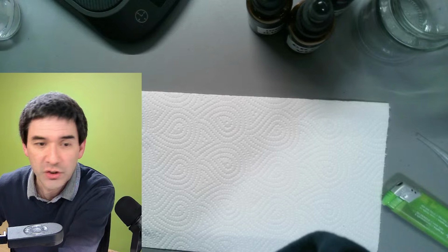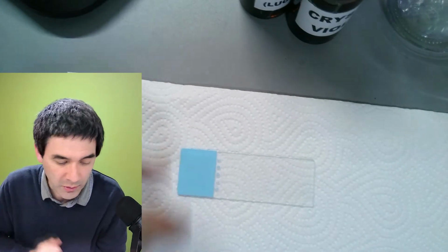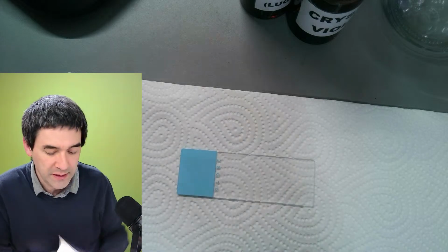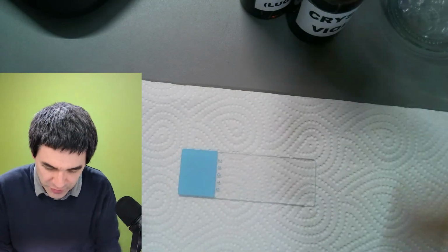Okay. And we're now going to actually start the staining process. And this takes now a little bit of patience. And we're going to get ready. The first thing that we have to do is crystal violet stain for 1 minute and then rinse with water. Okay, we're going to do that. Okay, so where's my crystal violet stain?